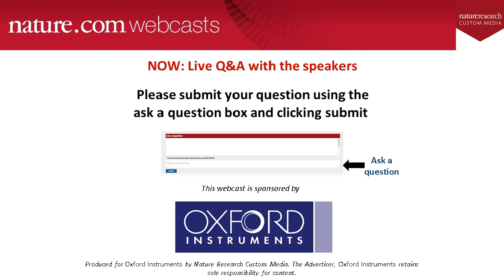Thank you. Yes, they were prepared relatively routinely. So these were samples from patients, so we had no control over the sample preparation with regard to the initial fixation. The initial fixation was an aldehyde fixation, and they were then rinsed and embedded in a resin, an epoxy resin, and then sent to us. So they didn't actually have a lot of heavy metal staining in the fixation process.